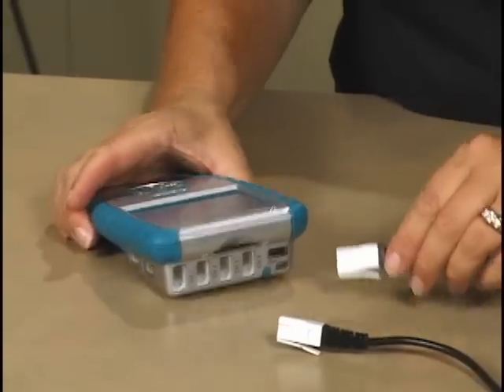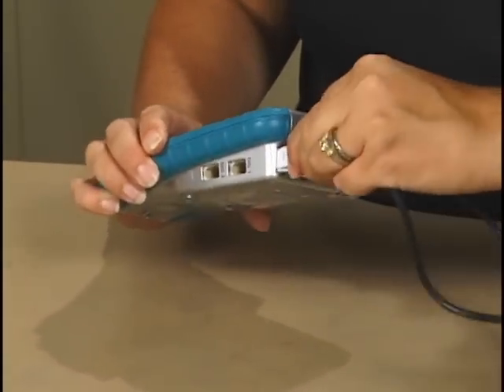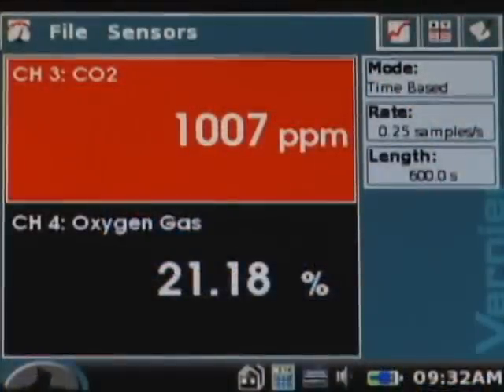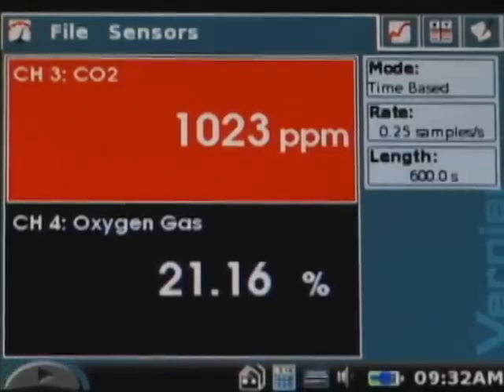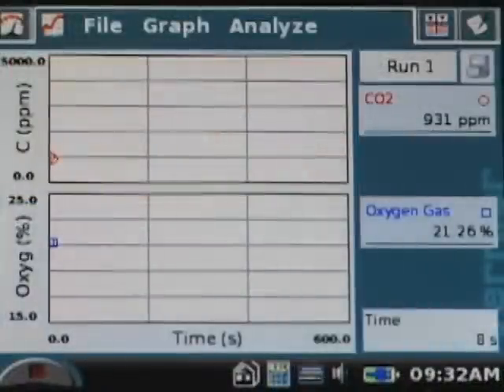Connect the sensors to any of the four ports on the top of LabQuest. The software auto-identifies the sensors and sets up data collection parameters that are perfect for this experiment. The CO2 gas sensor has a 90-second warm-up period. After 90 seconds, watch the CO2 readings to see that they've started to increase, then start data collection.